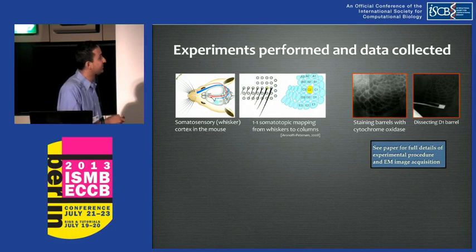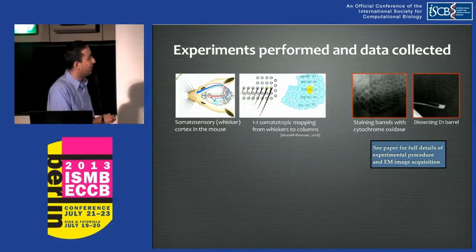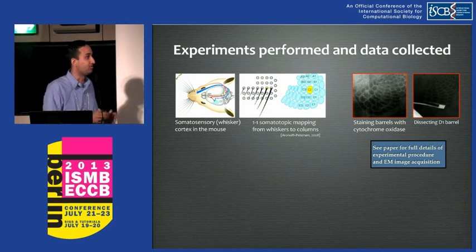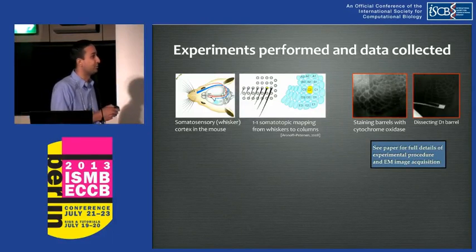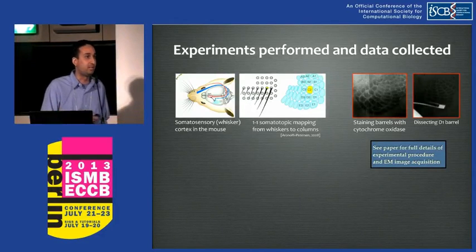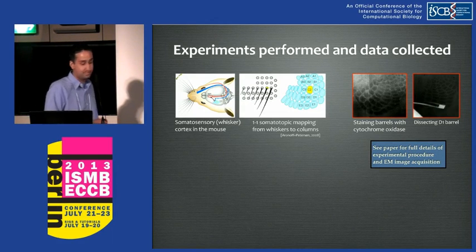And the advantage of this is that here I'm showing a piece of tissue of this region, and you can exactly identify this same region in old mice and young mice across all these different animals. So you can ensure that you're really capturing the exact same region. I mean, there are some depth issues here, but more or less capturing the exact same region across all these different animals. So it's one way to control for the variability that you would see otherwise.